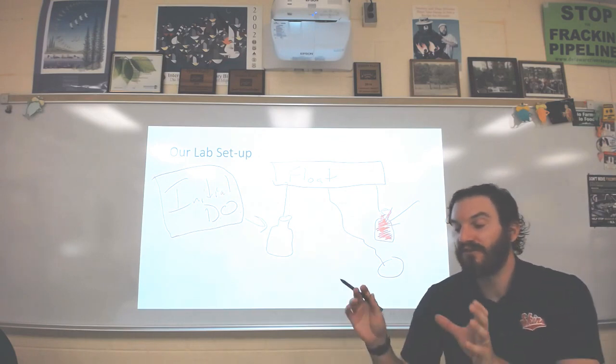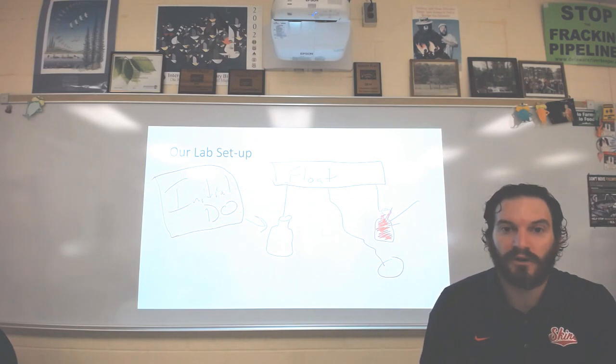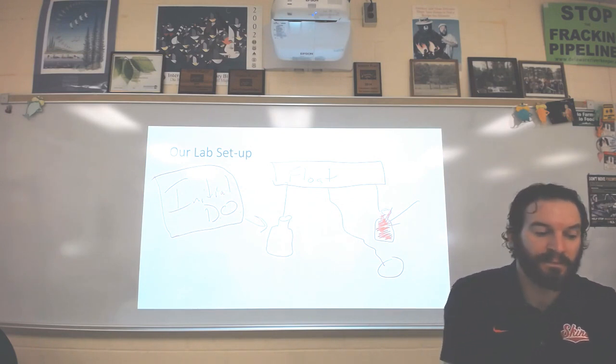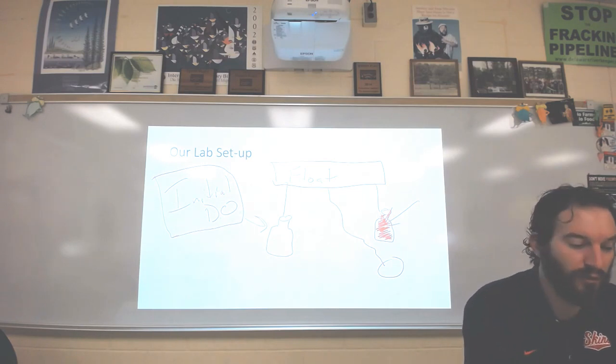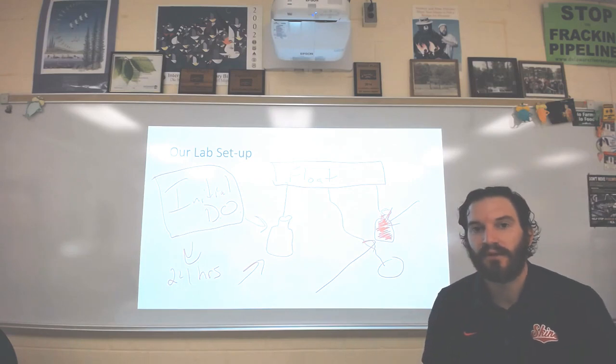So I'll put this in the water, and then I'm going to come back the next day, retrieve this, and record some more results from it. So after sitting for 24 hours, I'm then going to take these 2 bottles and very, very carefully open them up so as not to expose much extra air into them.